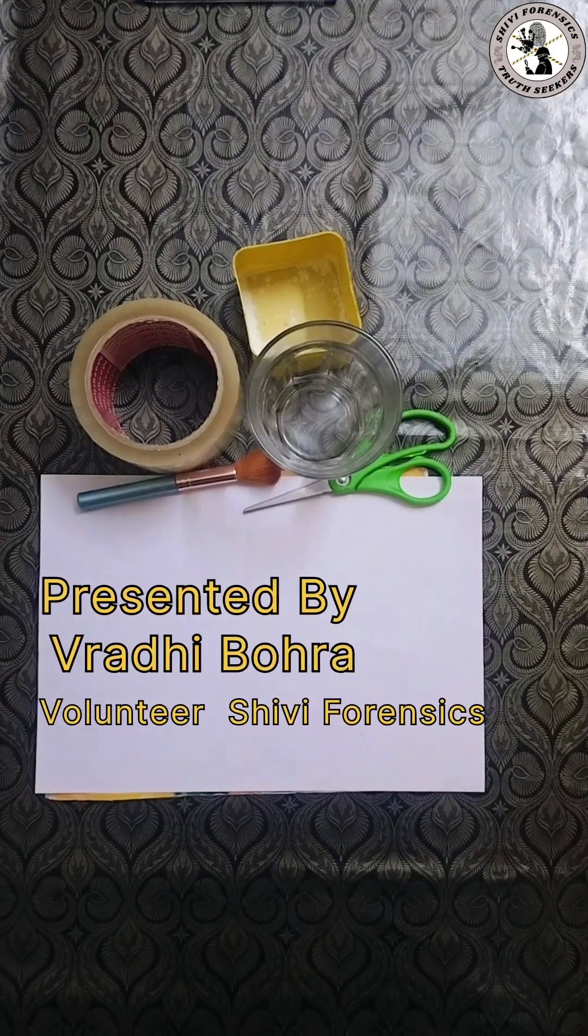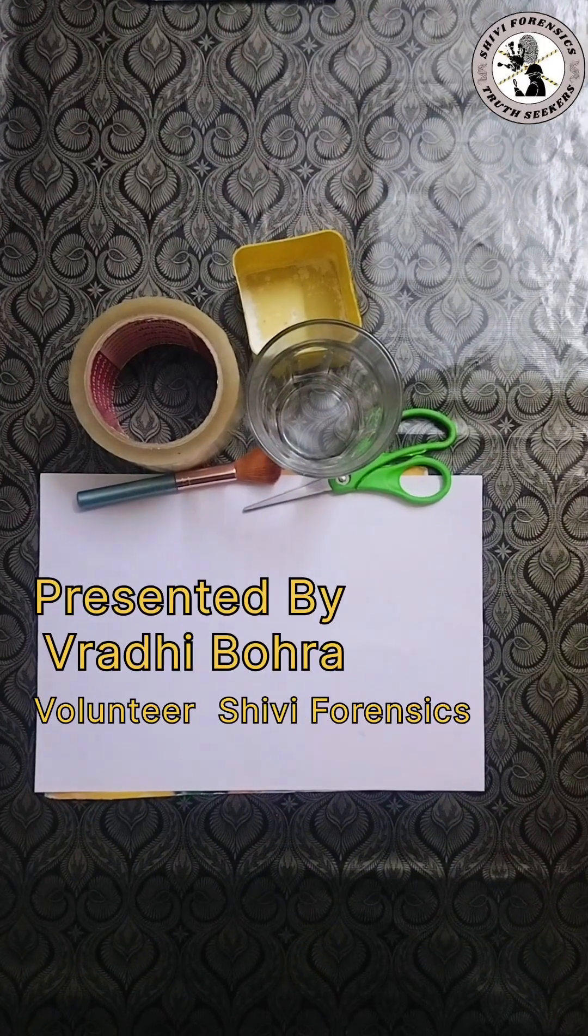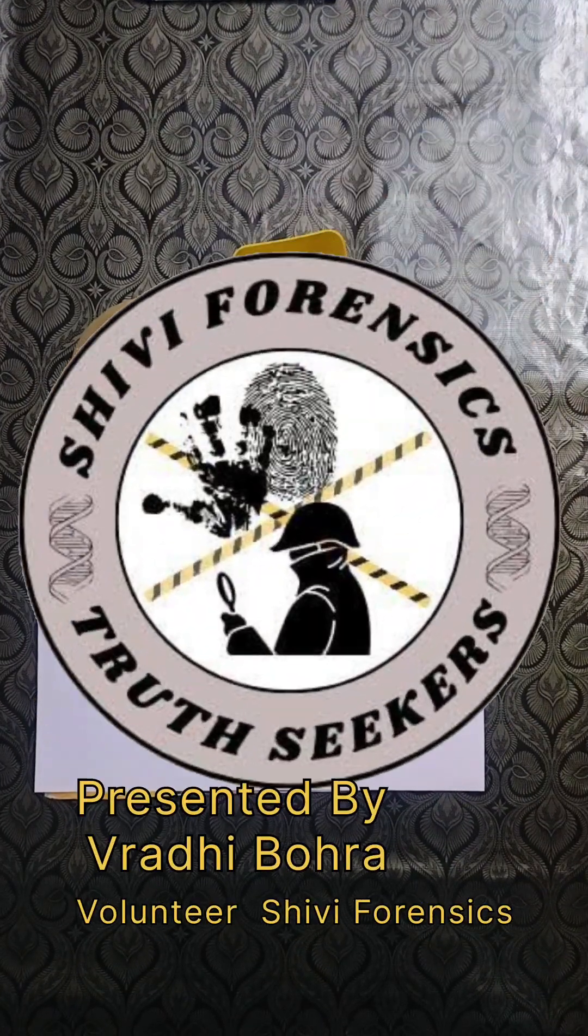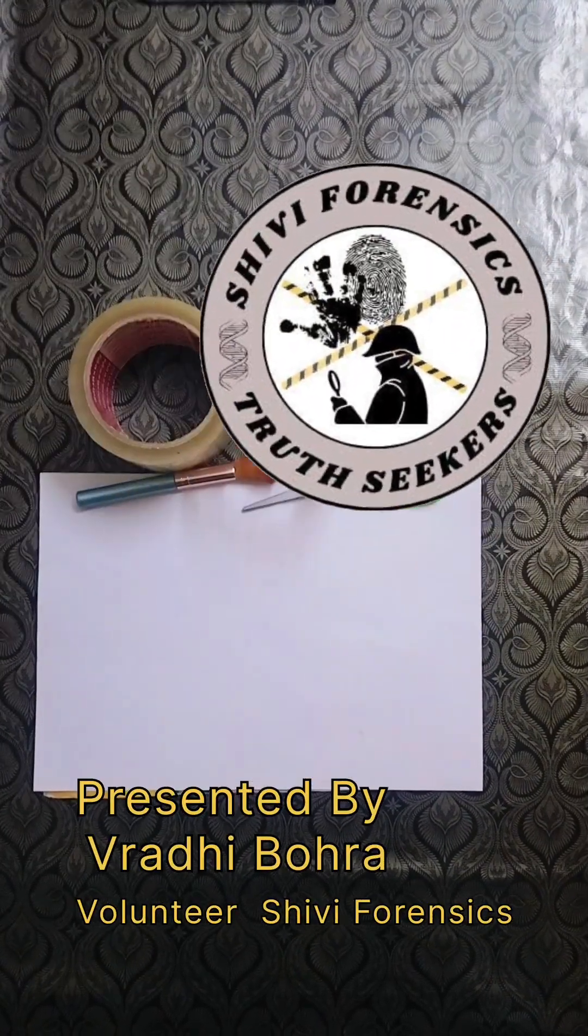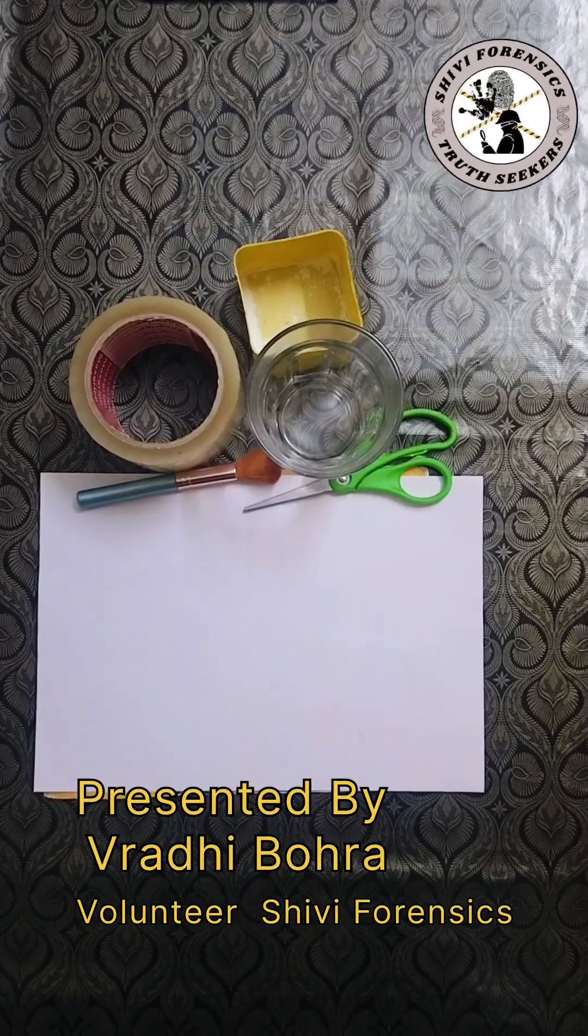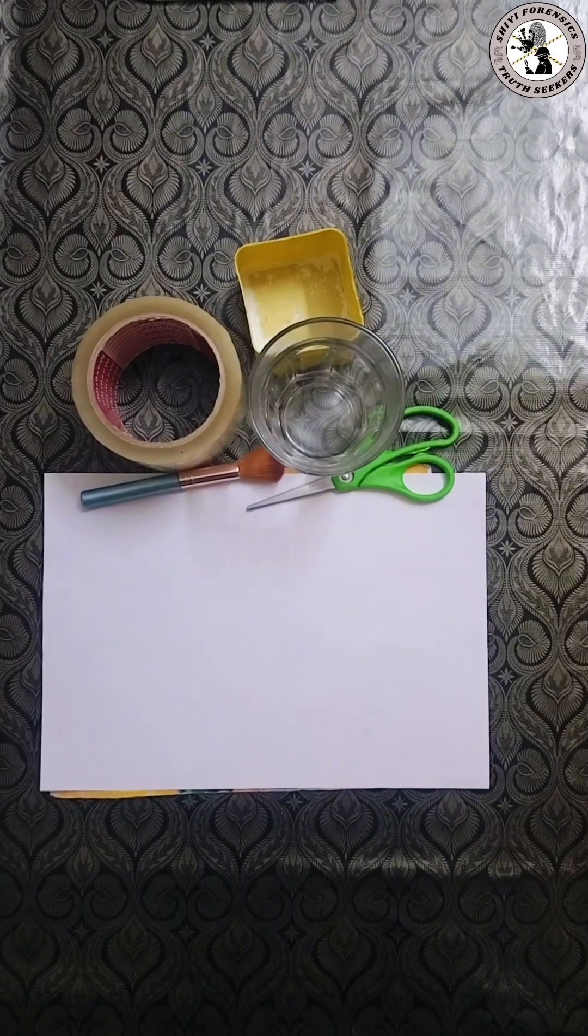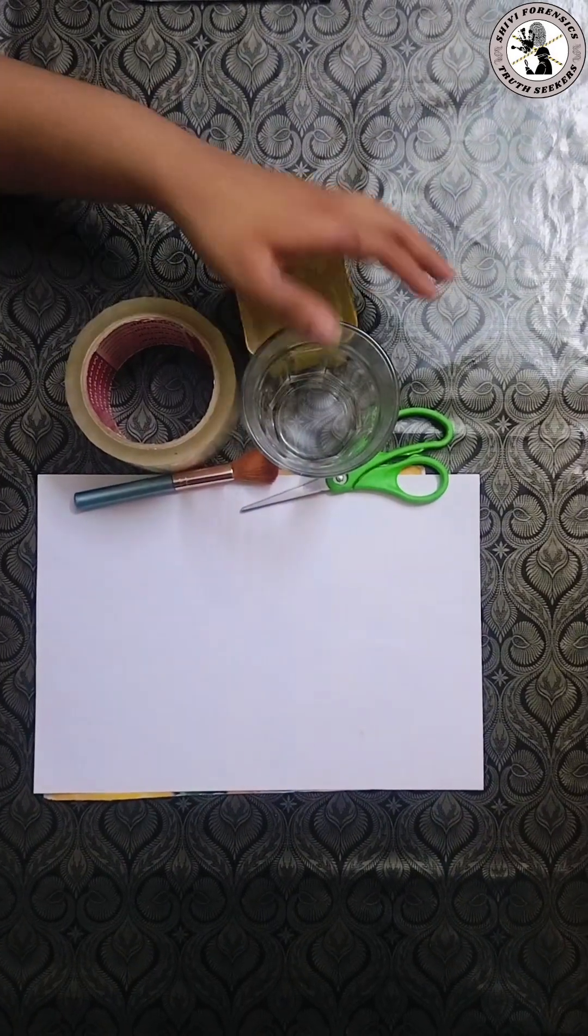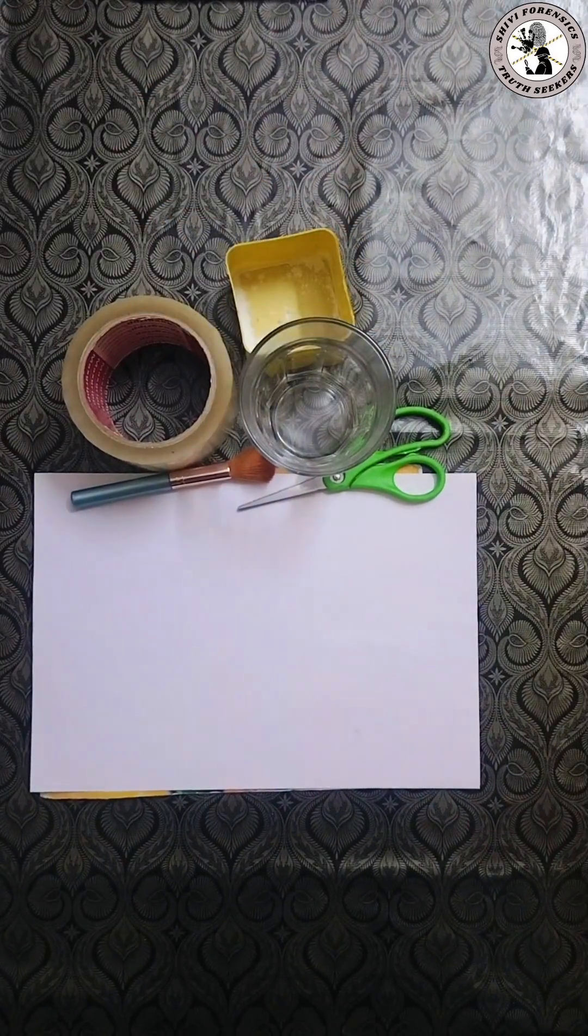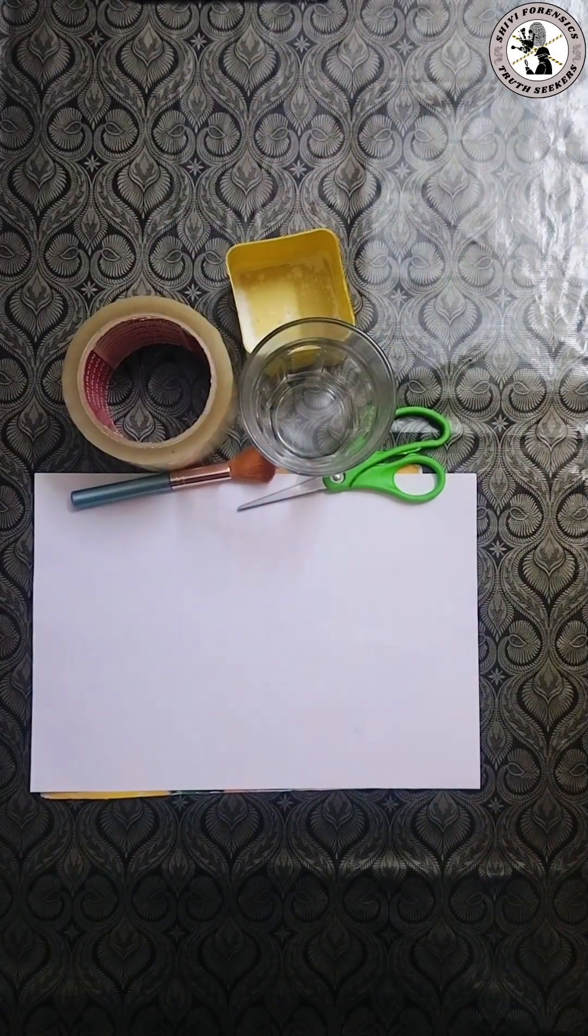Good morning everyone. I'm Pradipora, volunteer at CV Forensic Science. Today I will show you how to take fingerprints using glass and powder. A simple and basic method.